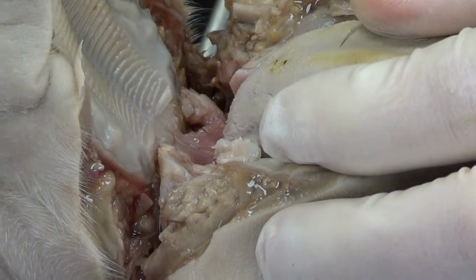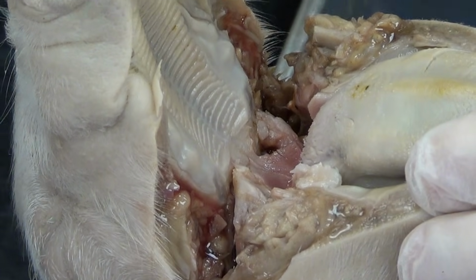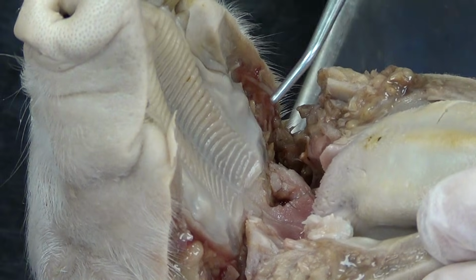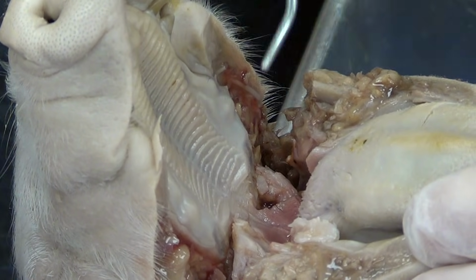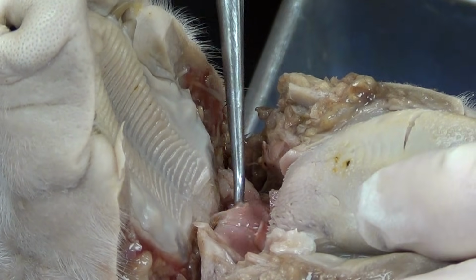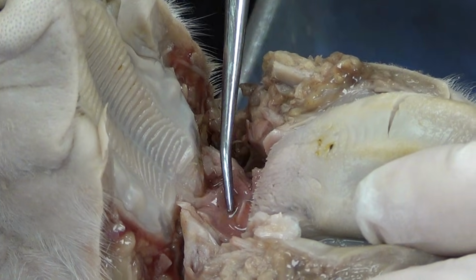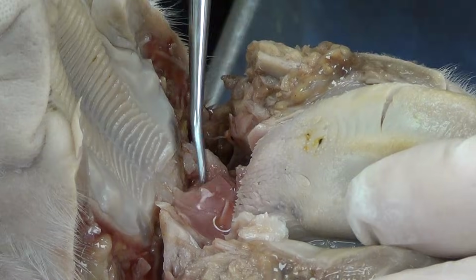Some of the structures I want you to be familiar with is the hard palate. That is this structure right here. They call it the hard palate because on the underside of this skin is going to be bone, so it's very hard. Behind that is going to be the soft palate, and you can see that this is actually torn away just a little bit, but it's mainly muscle and it's not as well supported by bone, so it's referred to as the soft palate because it's just soft tissue or muscle.